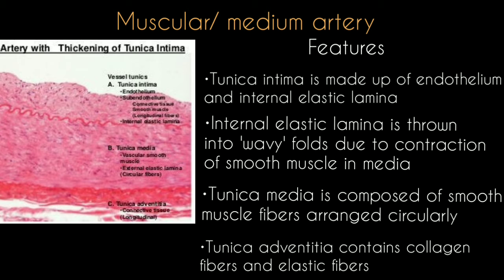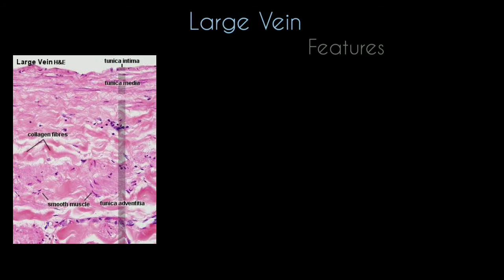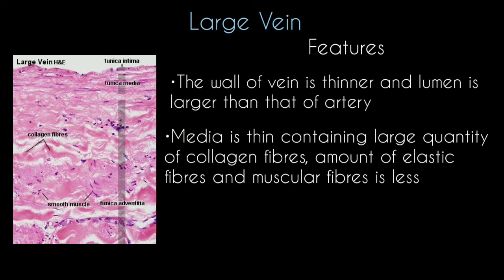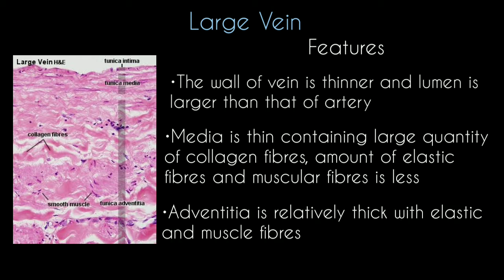The tunica adventitia of muscular arteries contains collagen fibers and few elastic fibers. In veins, the wall is thinner and the lumen is larger than that of an artery. The media is thin and contains a large quantity of collagen fibers, with less elastic or muscular fibers.